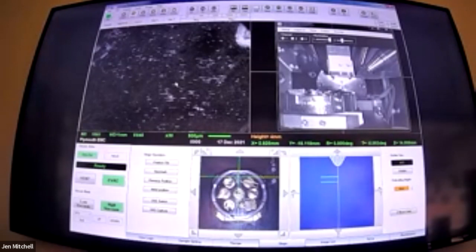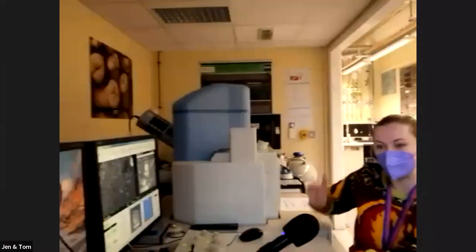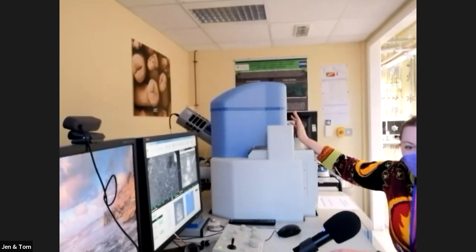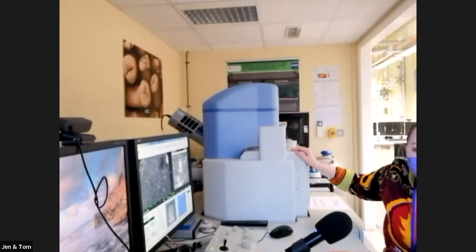Today we are on our JEOL 6610. Tom can spin the camera around and get a nice little view. So far we've been using our JEOL 7001, which is in a different corridor, but today we've got this little guy. It works kind of the same way, but rather than having a field emission gun at the top shooting electrons down, we have a tungsten filament, which is kind of like an old-fashioned light bulb, and that's what's making our electrons. This one has an extra feature, which is a variable vacuum.